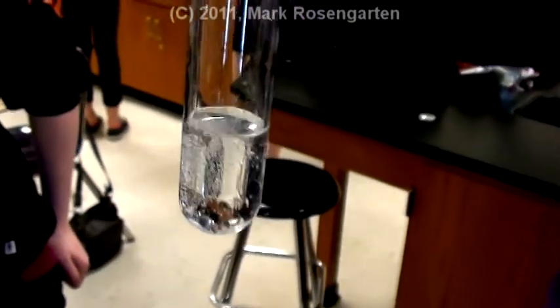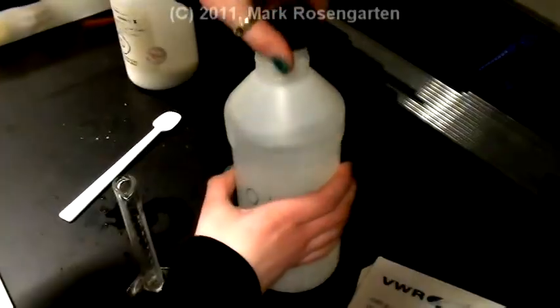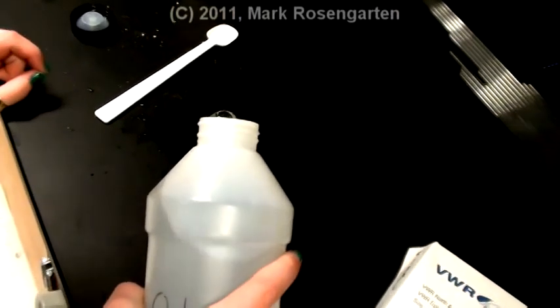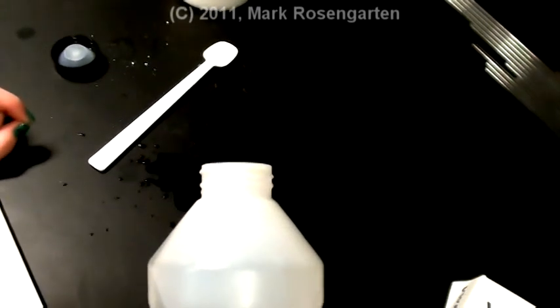Once the salt is all dissolved, place it into the test tube rack. Uncap the barium nitrate solution and very carefully measure out 10 milliliters of barium nitrate into a graduated cylinder.